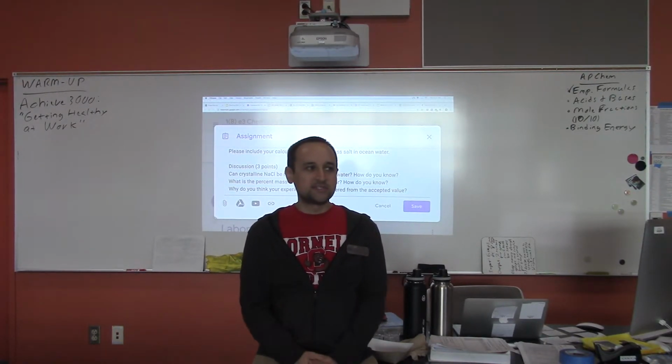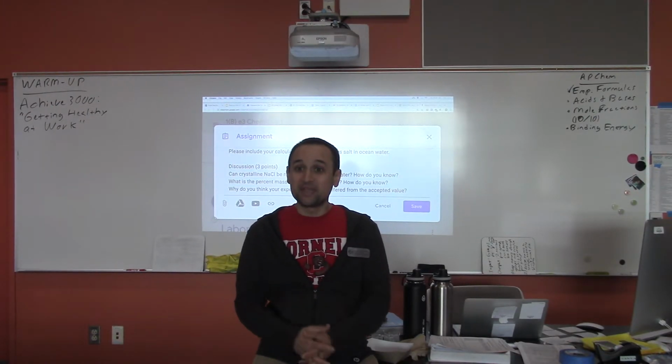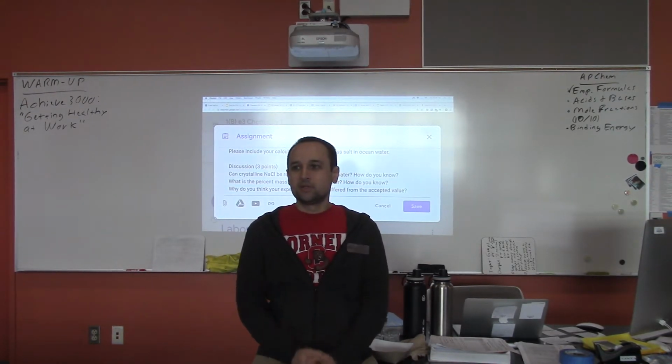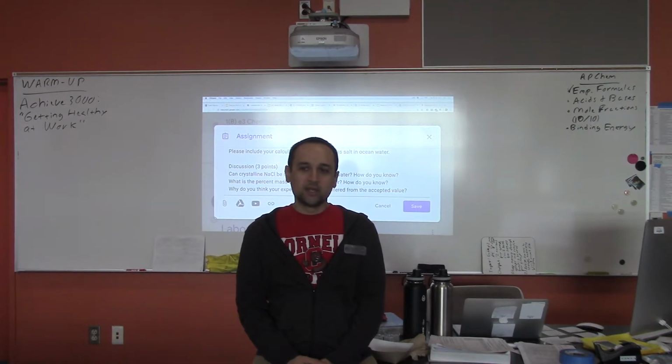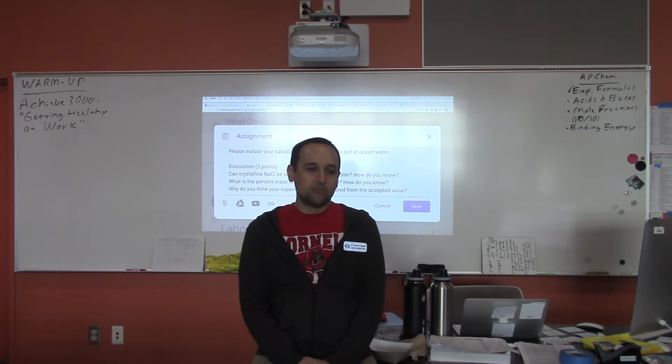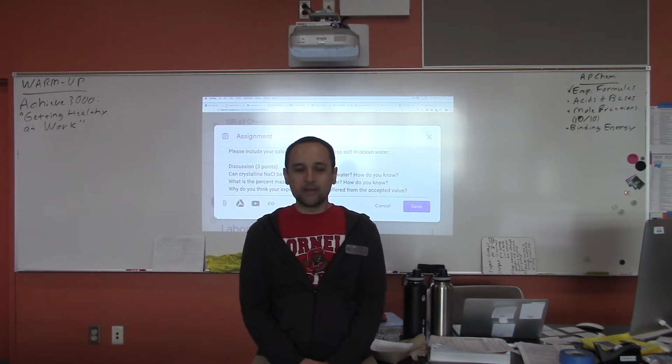That's why we call it in science a discussion section, not just a pure conclusion section, because we have more going on than just conclusions. Okay? We think and we speculate a little bit. Speculate means to... Yes, good. Make like an educated guess, right? Like I'm guessing based on what I know that the result we would get if we just left our beakers out to dry in air would be closer to 3.5%, than the result we got through boiling, all right?